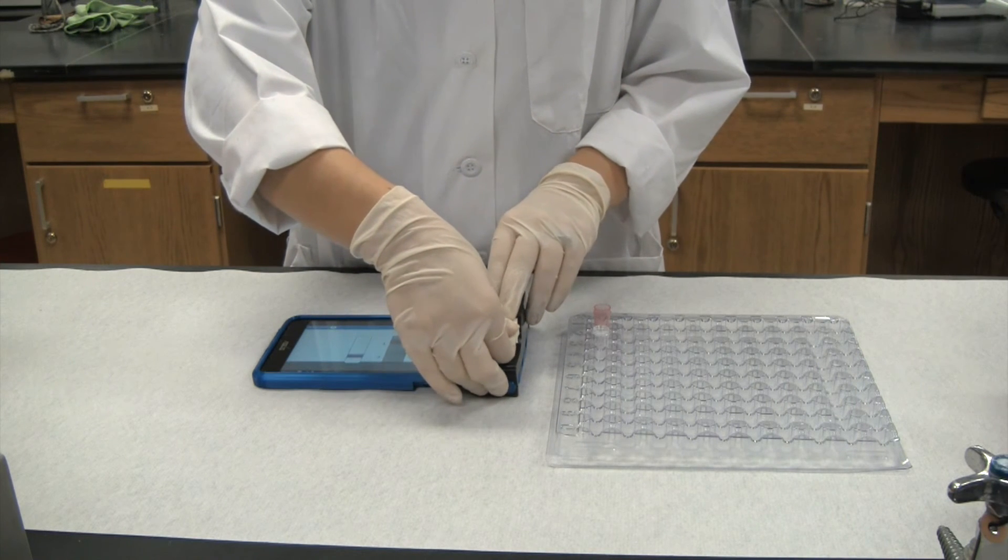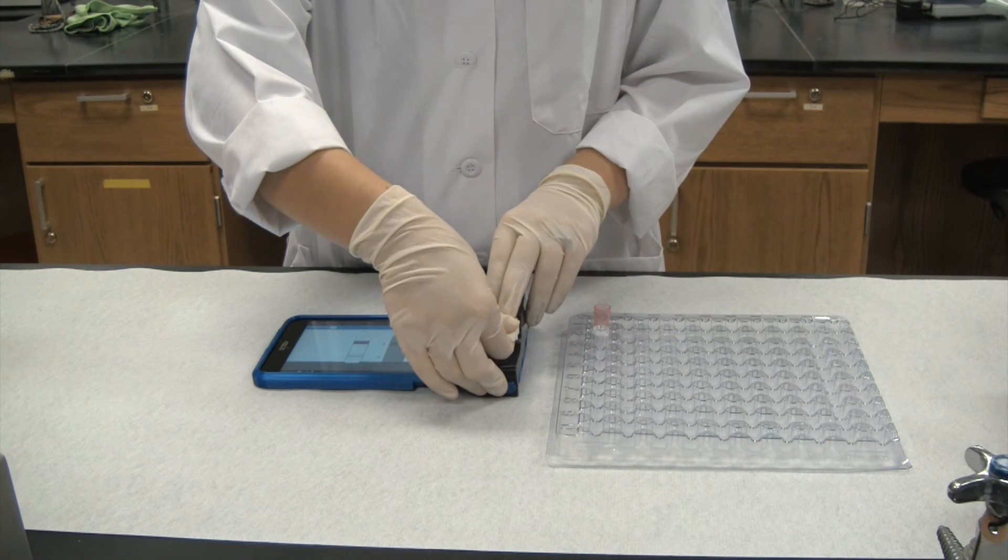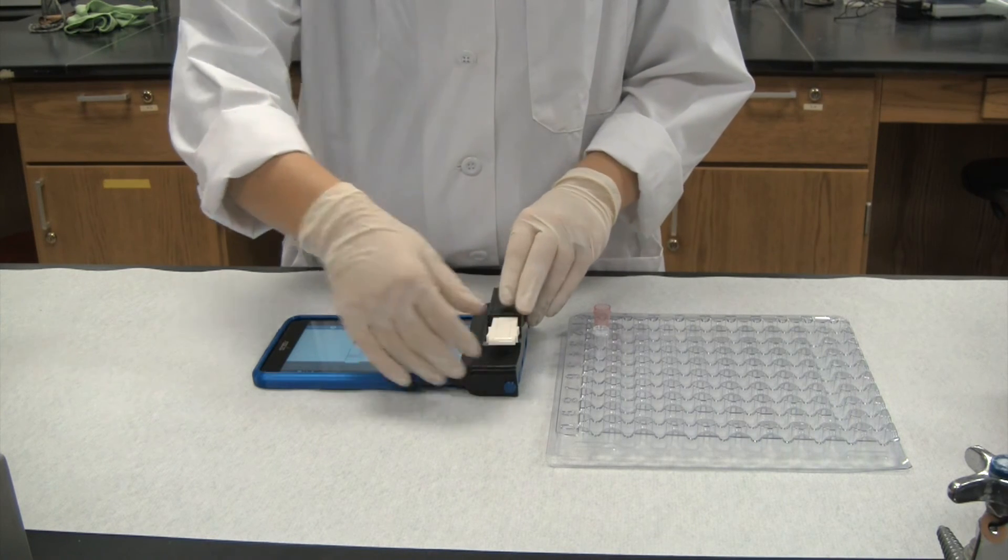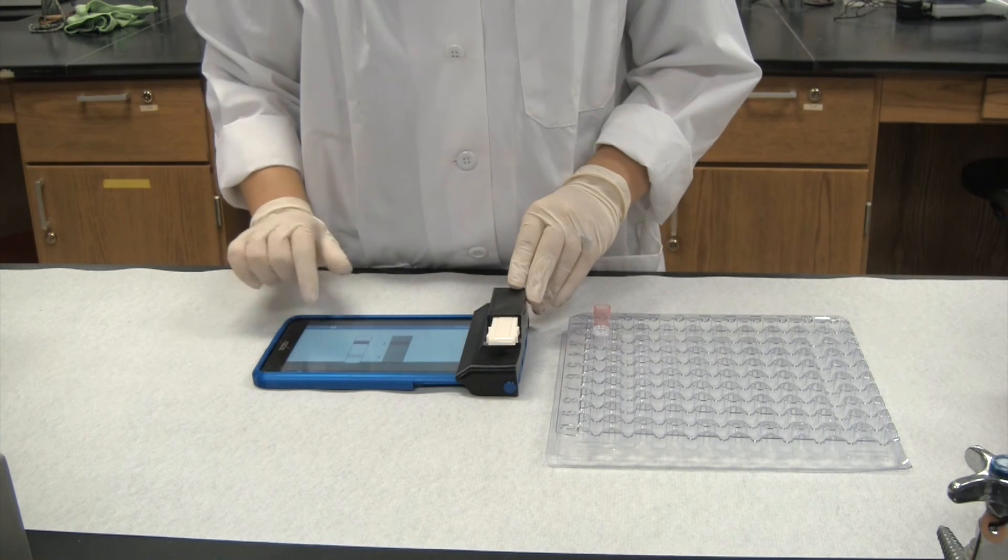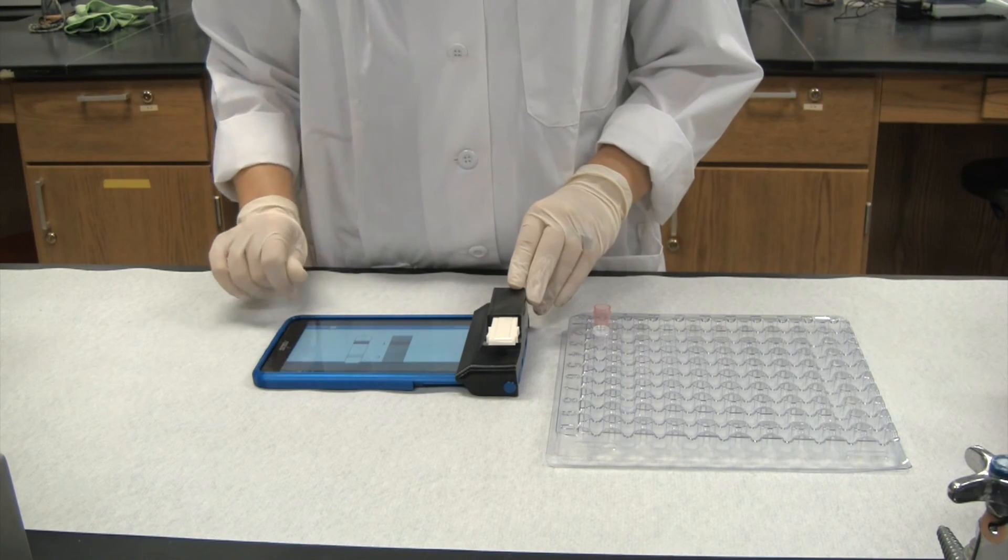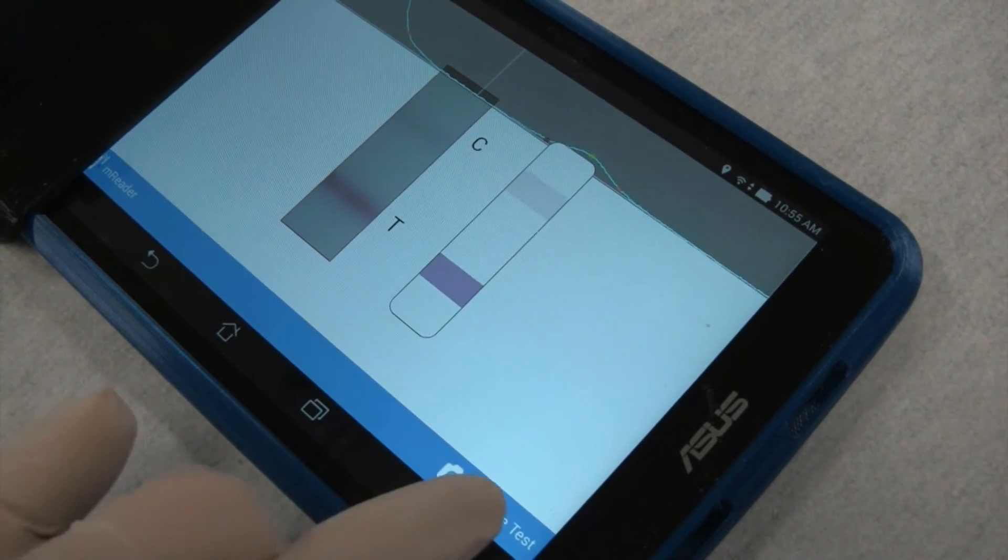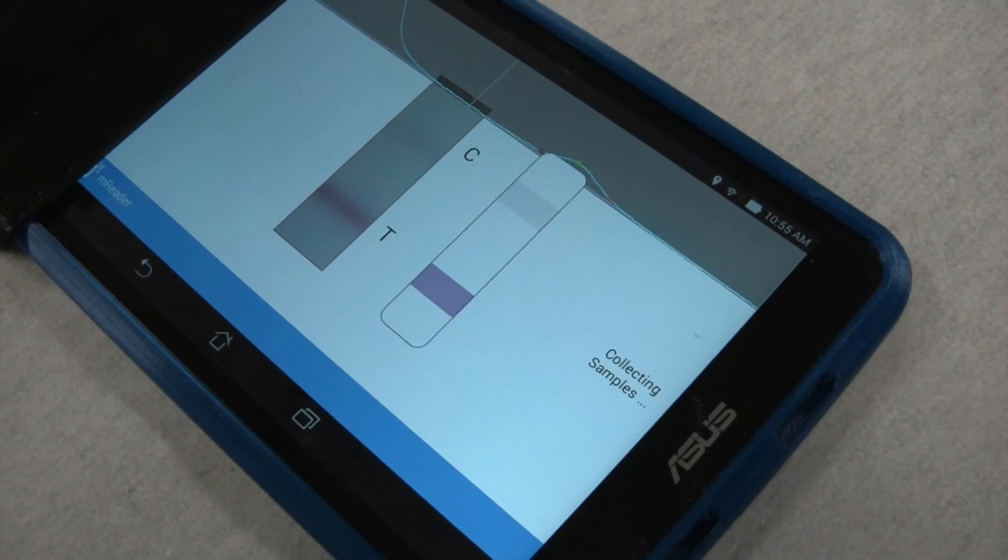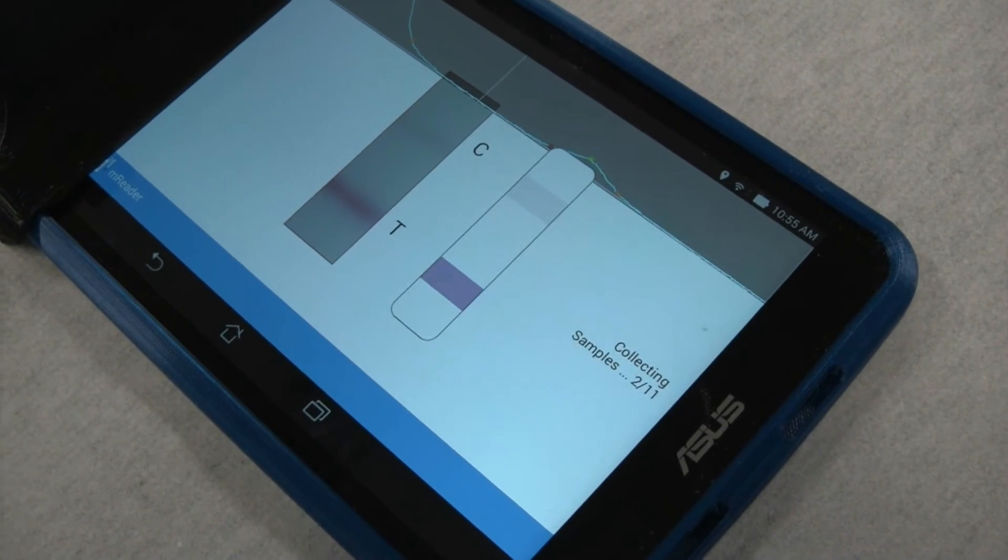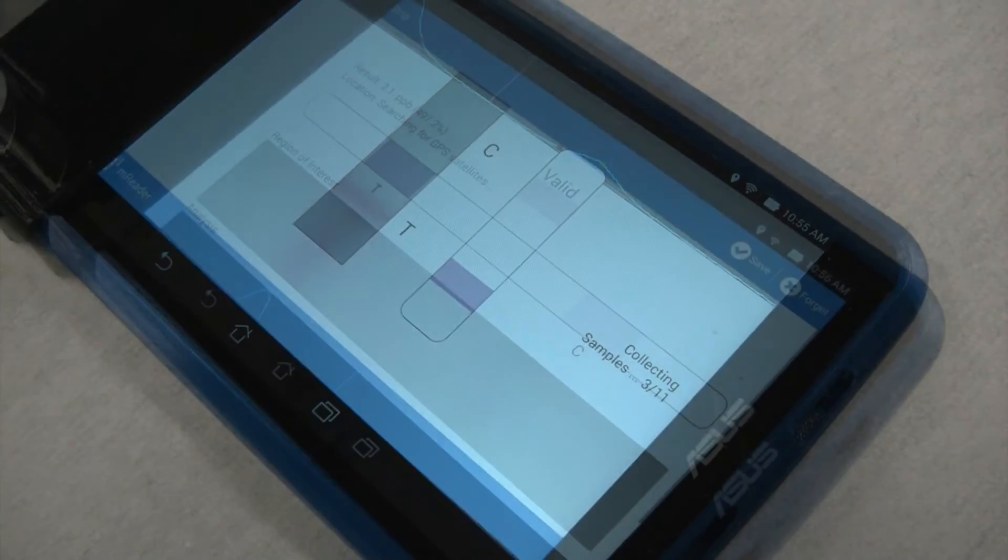Be certain that the tablet is on and the app is prepared so that the data will be named and stored in the appropriate folder. Be certain that the test indicator lines are centered over the camera, as demonstrated. Notice that the white line is centered between the peaks. When it is positioned correctly, tap on the capture data icon.